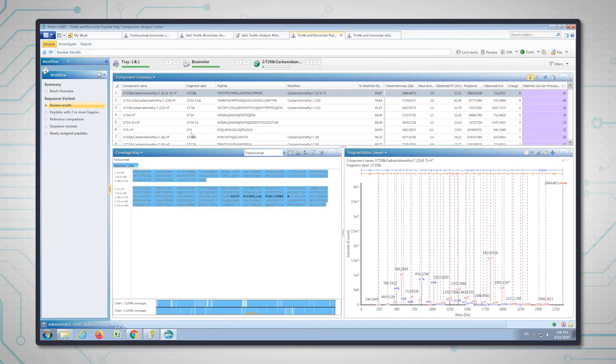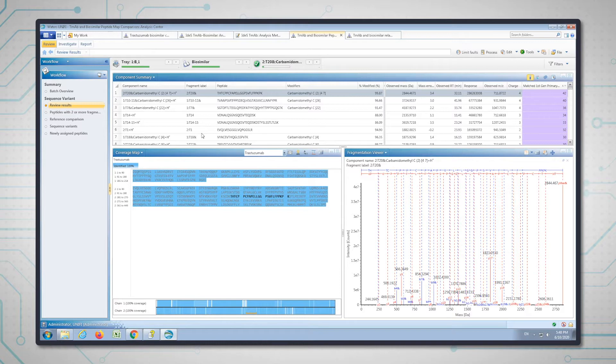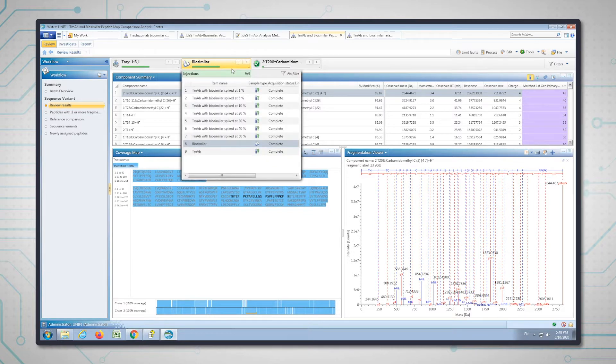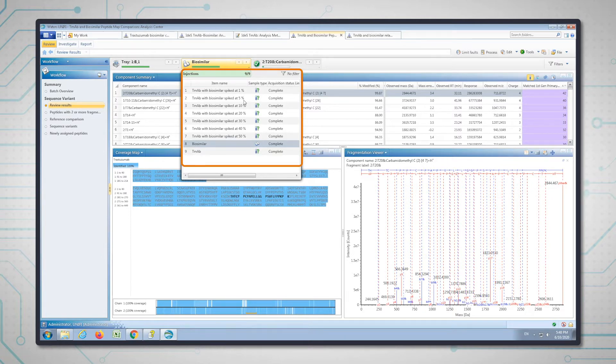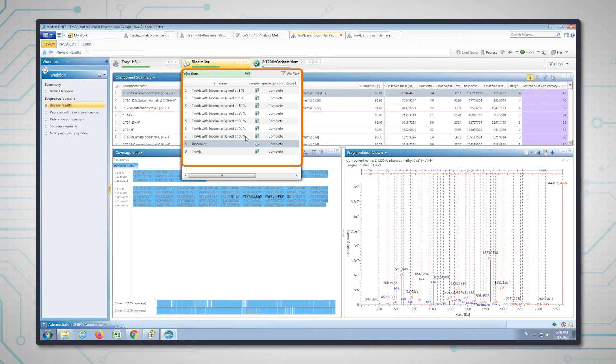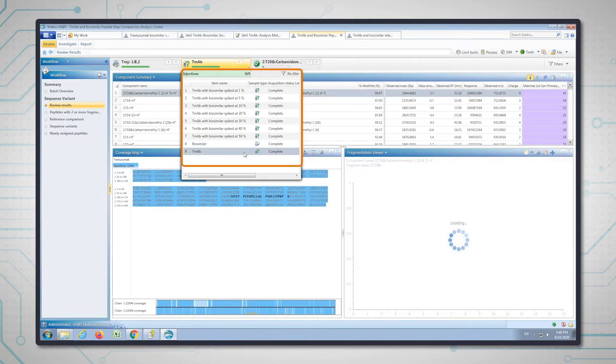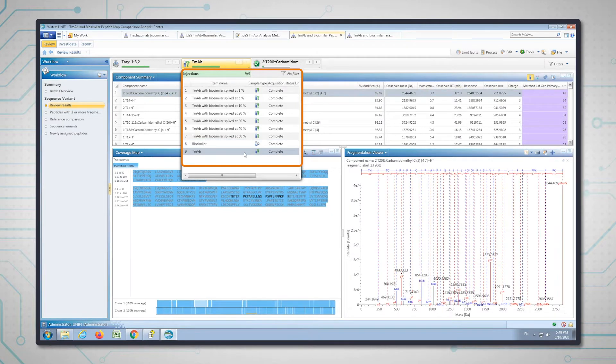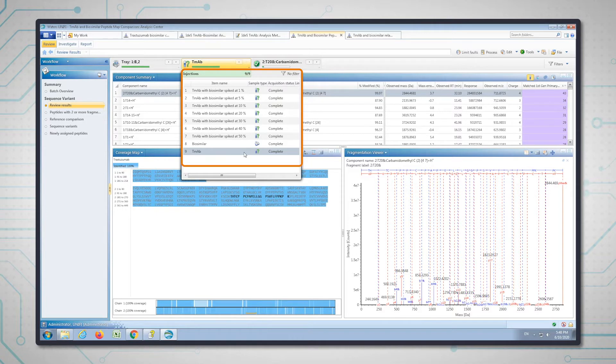I performed a tryptic digest on both the trastuzumab and the biosimilar molecule and also spiked the biosimilar into trastuzumab at different concentrations, starting from 1% of the biosimilar through to a 50-50 mix of the two molecules. This was done to see at what level we could detect the biosimilar, because in the real world a sequence variant could be present at a much lower percentage.